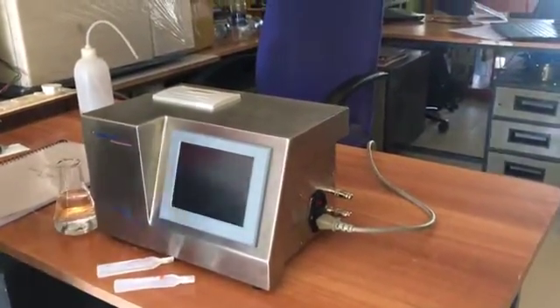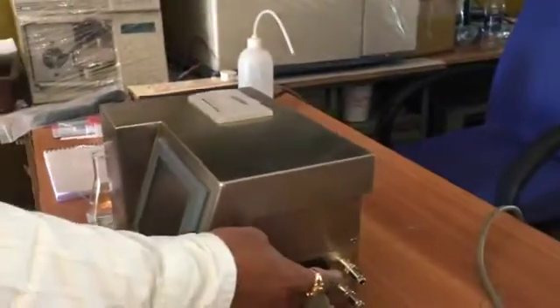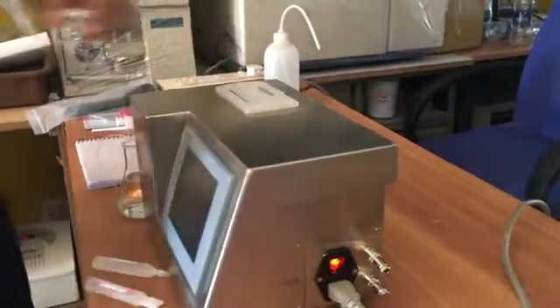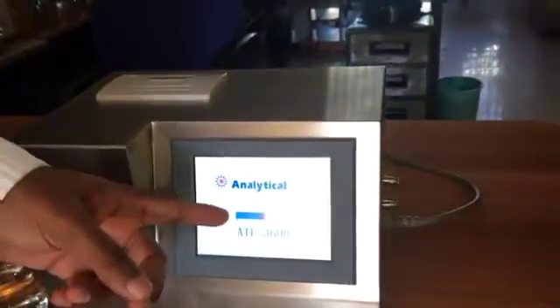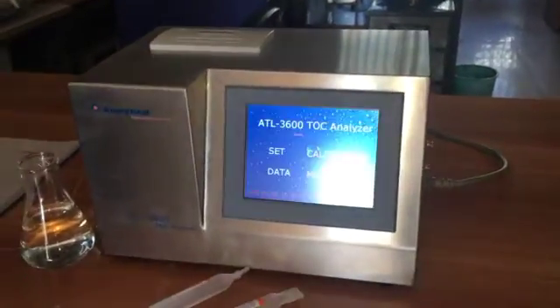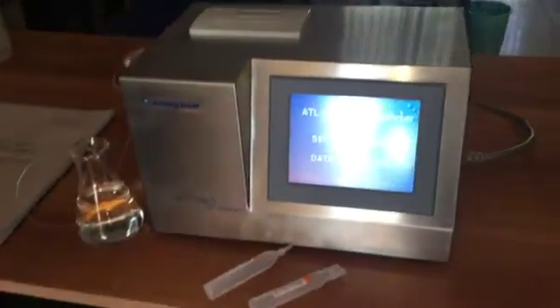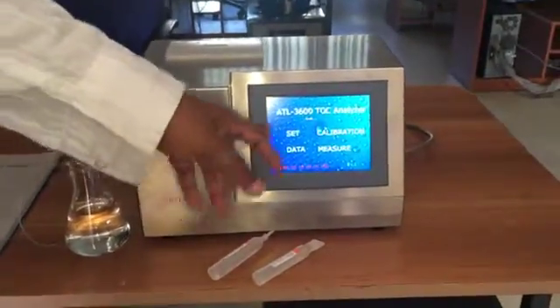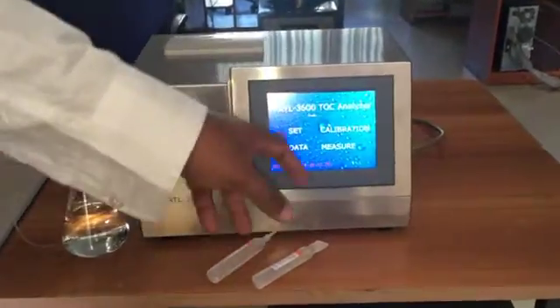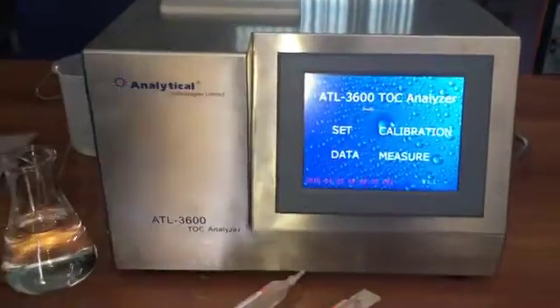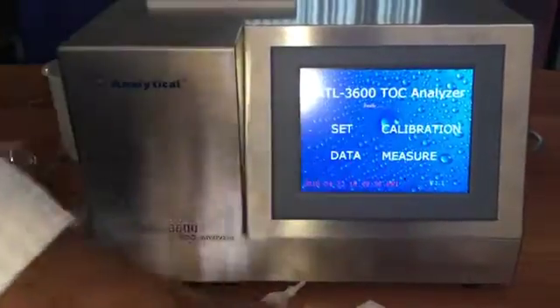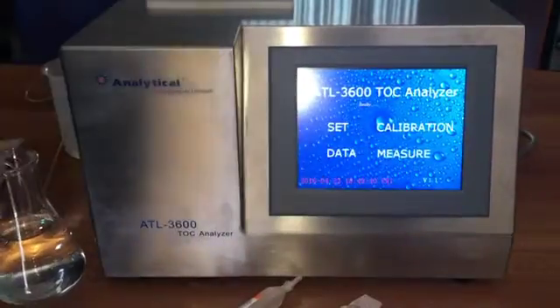The operation is very easy. Switch on the power from here and wait for the initial display. This is the initial display — you can see four menus: Set, Calibrate, Data, and Measure.